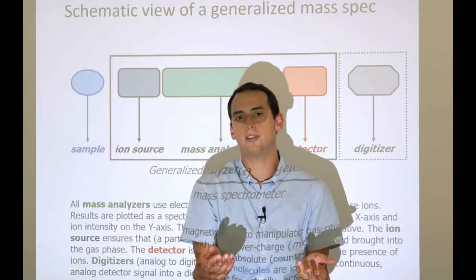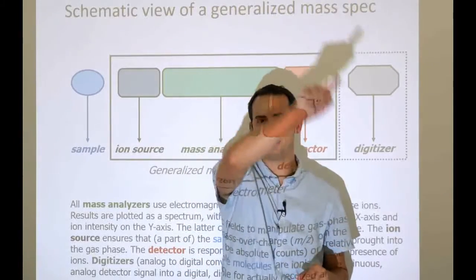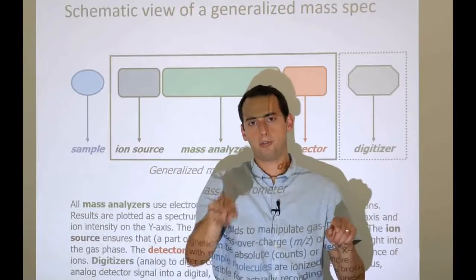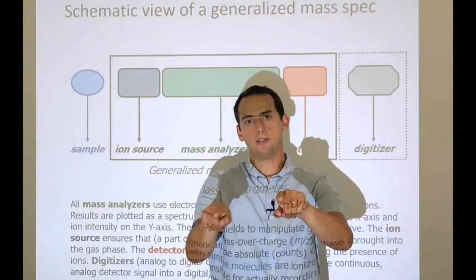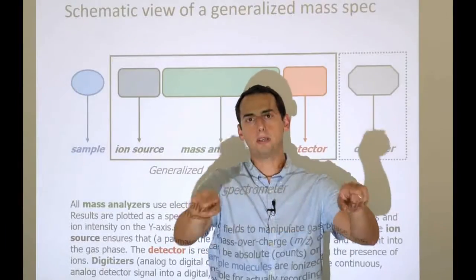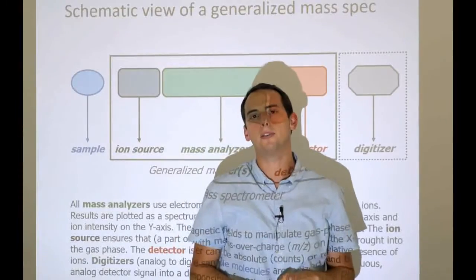Now, in this particular case, it's not too bad, but imagine if the original signal were like this, with a bump in the middle. Then we would measure it here, here in the bump, and here. And so what we would get is a very small signal, and we would be completely oblivious to the 2 peaks that flanked this valley where we had the measurement.